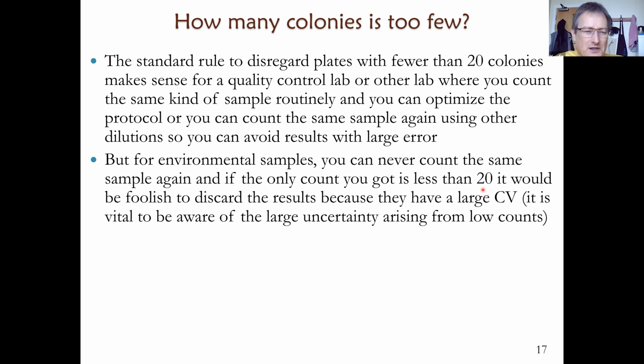If you're plating out 0.1 milliliter of a 10-fold dilution, you're actually plating out 0.01 milliliter from the original sample. So 0.01 milliliter of the original sample 2 times, because we have 2 plates, and then 2 plates with a higher dilution, which is 0.001 milliliters of the original sample. So we've plated out 0.022 milliliter of the original sample in this example.